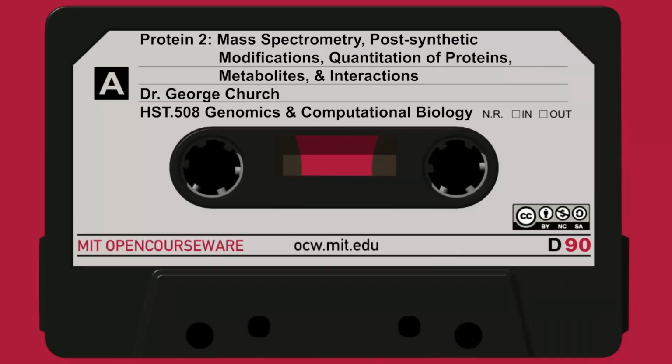And so here's a real example. We're going to work through it so that you can see what happens to a typical peptide here in the upper right-hand corner. And this is tandem mass spectrometry. Remember, if you think of there was a single mass peptide that was then broken into all these little pieces, the almost intact peptide will be on the far end of the horizontal axis, which is the mass axis, close to 1,200 atomic mass units. And then relative abundance is the vertical axis, and it's just related to the ion counts. And you can see there's some variation here. This is not due to ionization. This is due to the cleavage efficiency of cleaving at each of the bonds.